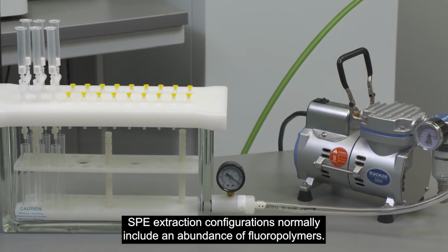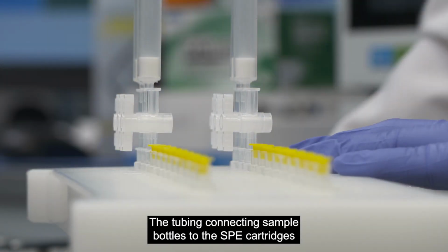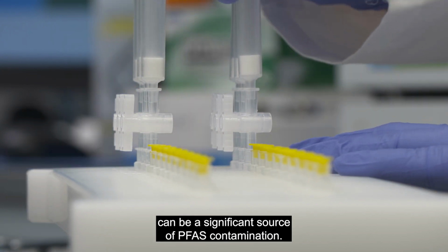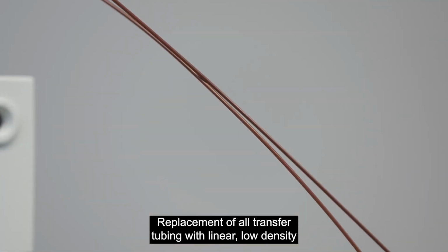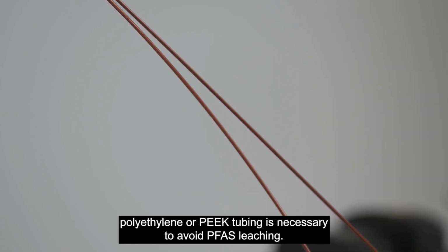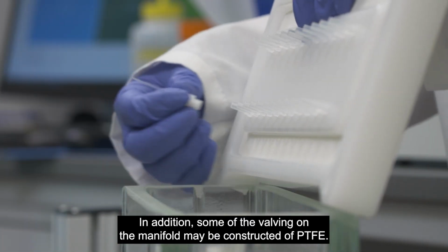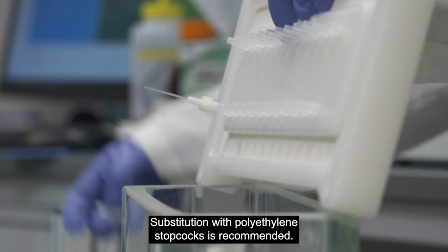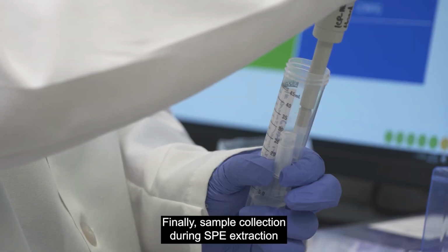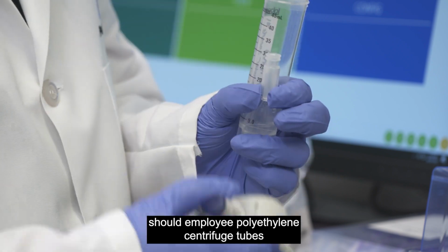SPE extraction configurations normally include an abundance of fluoropolymers. The tubing connecting sample bottles to the SPE cartridges can be a significant source of PFAS contamination. Replacement of all transfer tubing with linear low-density polyethylene or PEEK tubing is necessary to avoid PFAS leaching. In addition, some of the valving on the manifold may be constructed of PTFE. Substitution with polyethylene stopcocks is recommended. Finally, sample collection during SPE extraction should employ polyethylene centrifuge tubes.